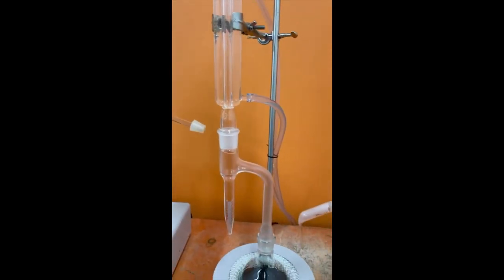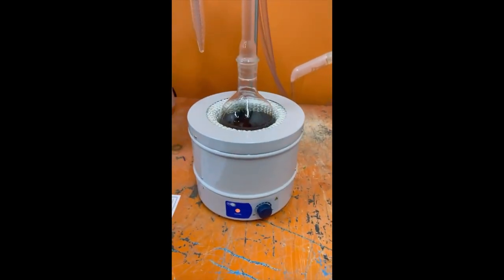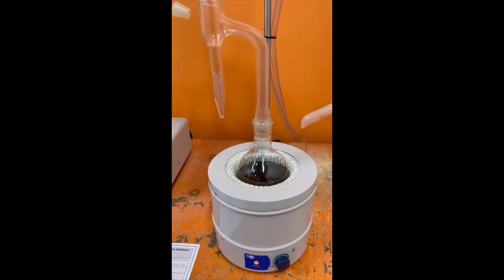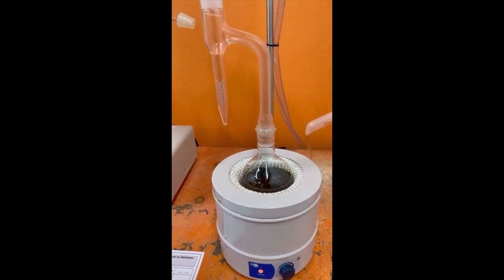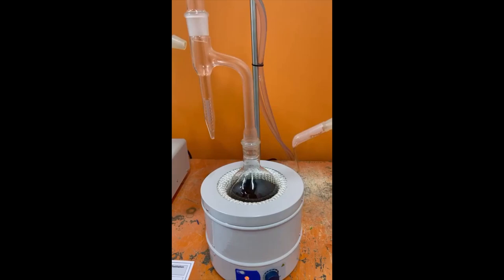And apply heat to the system. Adjusting the rate of boiling so that the condensed distillate discharges from the condenser at the rate of 2 to 5 drops per second.